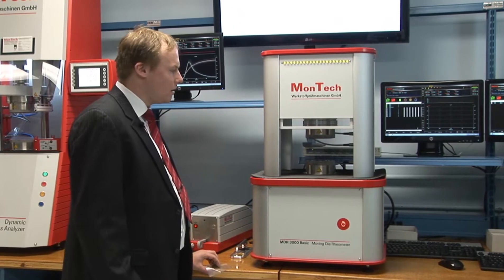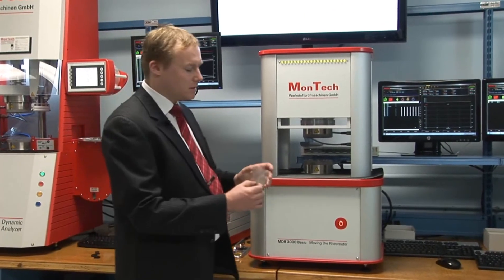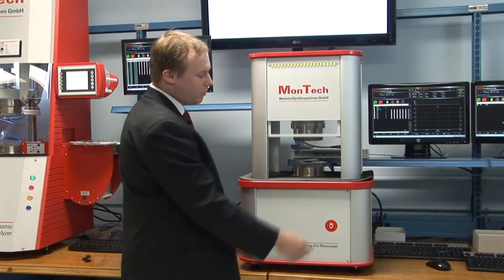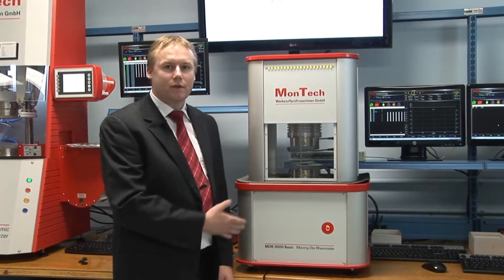Running a test on the MDR3000 BASIC is very easy. You set up a test sequence in the software, place the sample to the die, push the start button, the safety shield comes down and the main cylinder is closed. The software automatically starts the motor and begins recording the data.